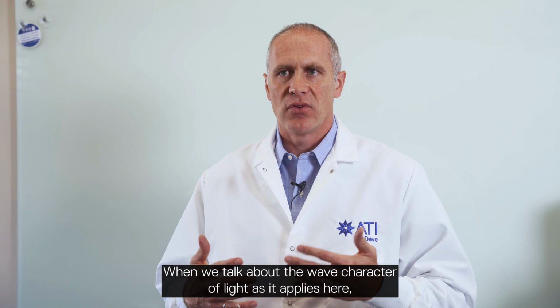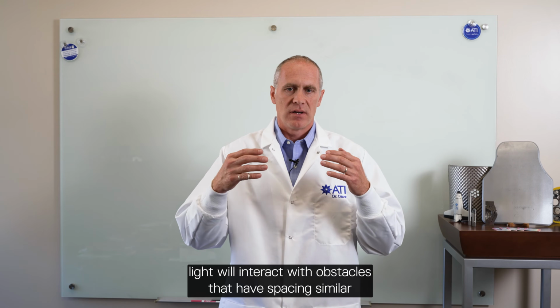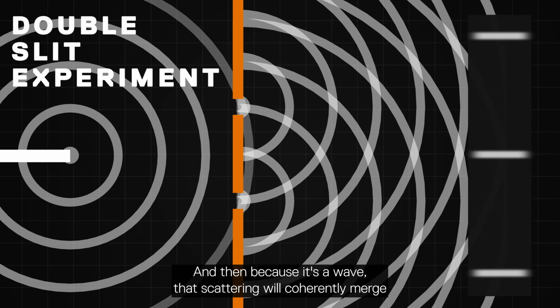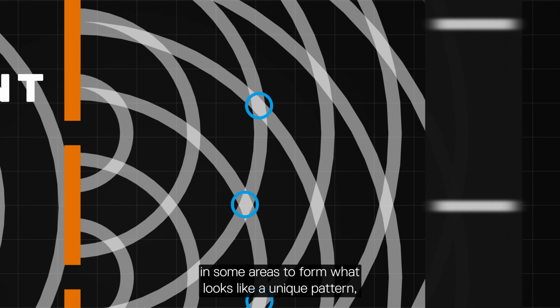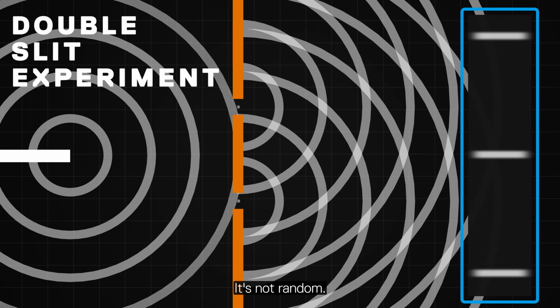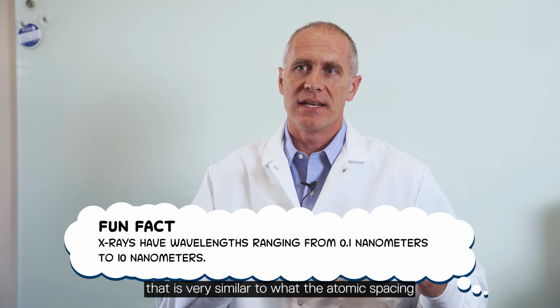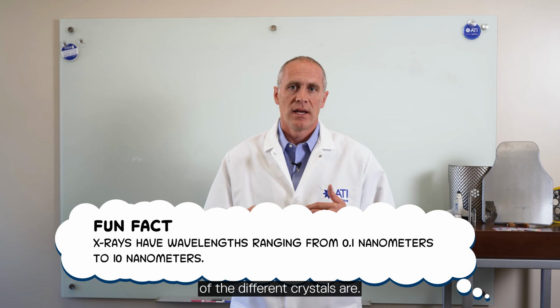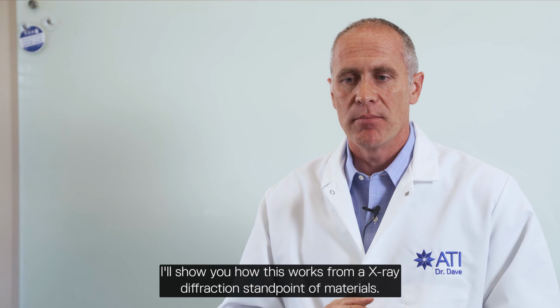When we talk about the wave character of light, as it applies here, light will interact with obstacles that have spacing similar to the wavelength of the light in a way where it'll scatter the light, and then because it's a wave, that scattering will coherently merge in some areas to form what looks like a unique pattern, randomly split through whatever the space is. It's not random. In the case of metals, it was discovered that X-rays have a wavelength that is very similar to the atomic spacing of the different crystals. And going back to the board, I'll show you how this works from an X-ray diffraction standpoint of materials.